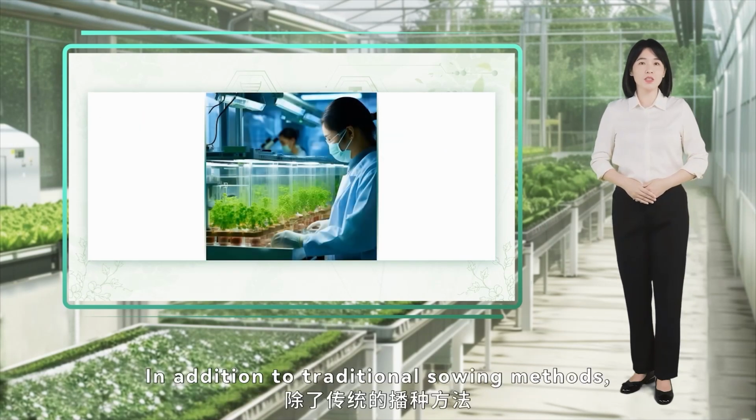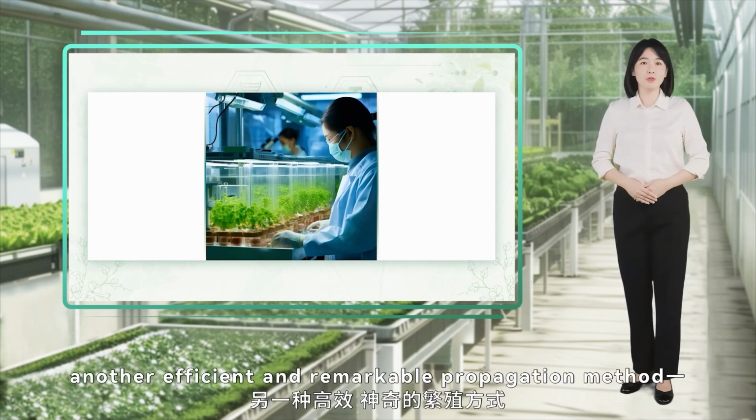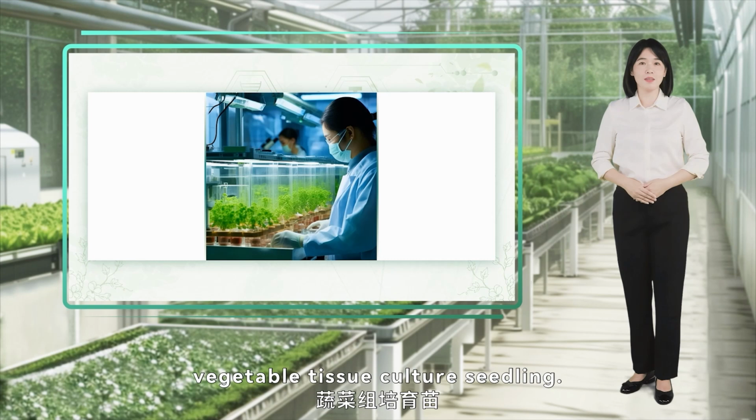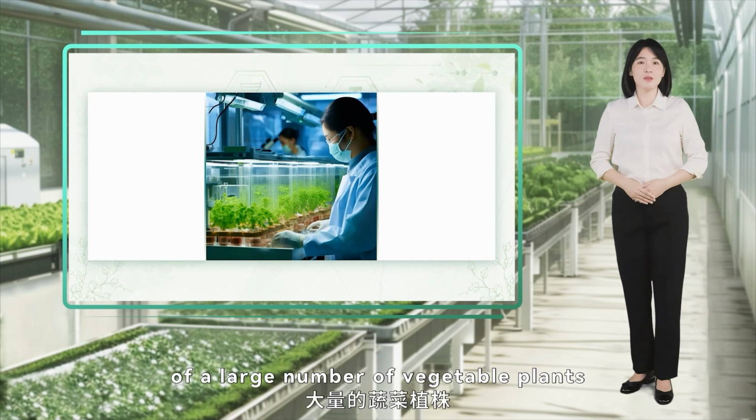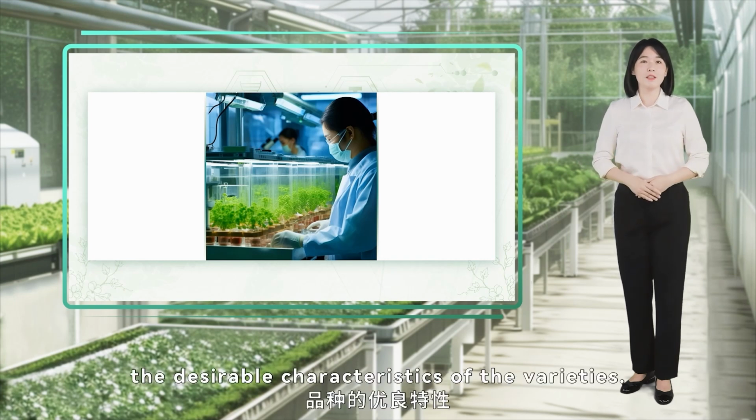In addition to traditional sowing methods, modern technology offers us another efficient and remarkable propagation method, vegetable tissue culture seedling. This technique not only enables the rapid propagation of a large number of vegetable plants, but also preserves the desirable characteristics of the varieties.